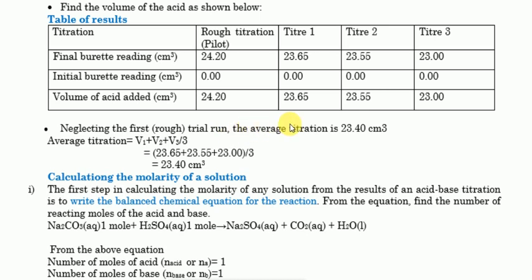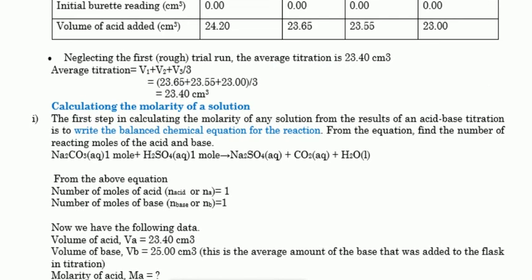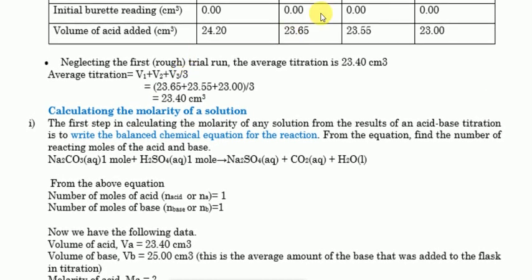Kwa ili wajue kama unaweza kufanya vizuri maswali yanayoendelea, lazima kwanza angalia hii table. Hii table ukikosa tu hapa, mwalimu anayejua na mbele anaweka kosa yote, hashughuliki hata kuyasoma. Kwa sababu gani? This table and calculating the average volume of acid used is the basic procedure in calculation of molarity of acid. Now what we are saying, kwanza hapa lazima ujue hii table.